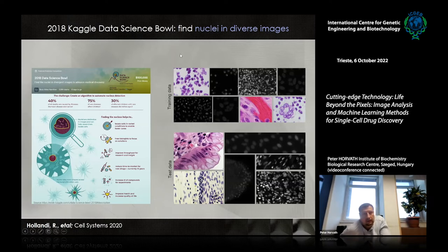And we said, okay, this is what we did in the last 10 years. So probably we should win this competition, and we went. It actually turned out that this was probably the largest bioinformatics competition ever, with nearly 4,000 participants, actually teams were up to 10 people. So we badly failed, actually. Our methods were in position 1,000 or something like that, which, after 10 years of research, is quite disappointing. It turned out that this was pretty much the first occasion when people started to use deep learning seriously in our field. And with deep learning, at least the first 200 groups were using it very efficiently. So we also started to use deep learning, and with that, we could end up in position 50 or so.